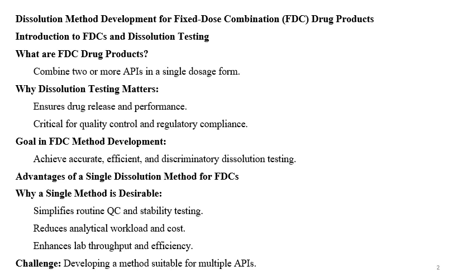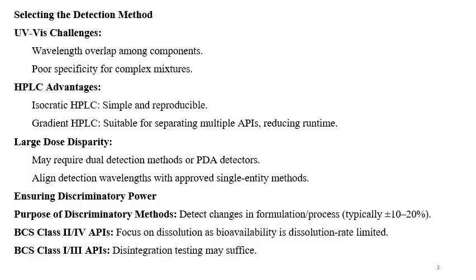Developing a single dissolution method with robustness and the required discriminatory power is very challenging, as the FDC contains multiple APIs. These APIs have different physicochemical properties, different dose, and different solubilities. First is selecting the detection method. So you can use UV visible or HPLC based method.